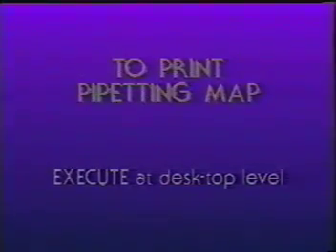When you have finished marking wells, FACSDesk will print out your protocol as a pipetting map to aid you with your laboratory benchwork. To request a protocol printout, place the cursor next to your protocol drawer and press Execute. The word Working will flash, indicating that the secretary is putting your request on the printer queue.